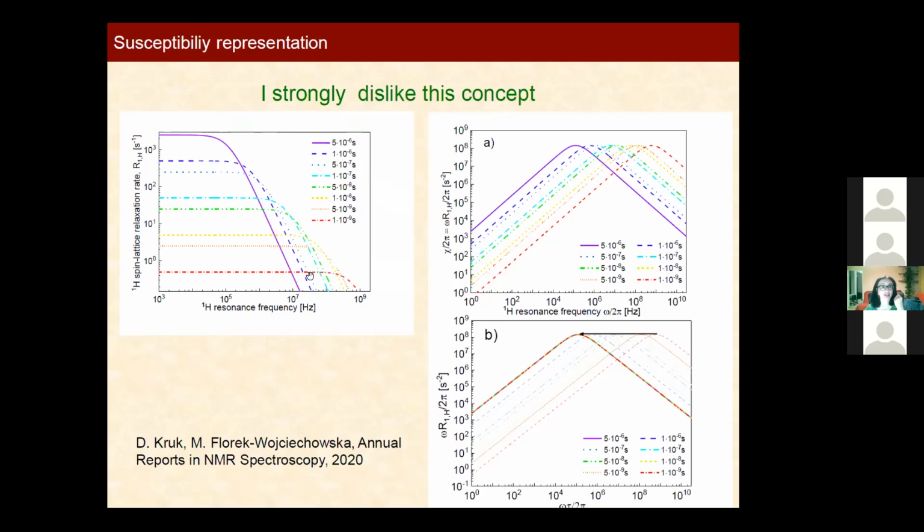We collect the relaxation dispersion curves, and we just like them in this form, that are flat at low fields, and so on. And being asked to present them in a different representation is spoiling them. What for should I present them in a different representation? But this is, I would say, a personal opinion.